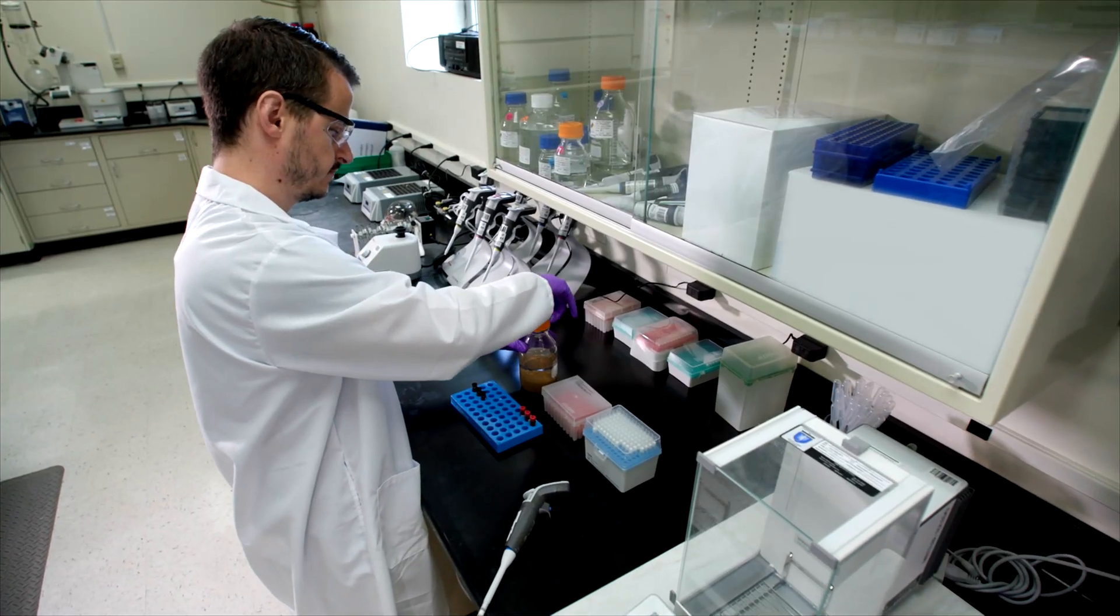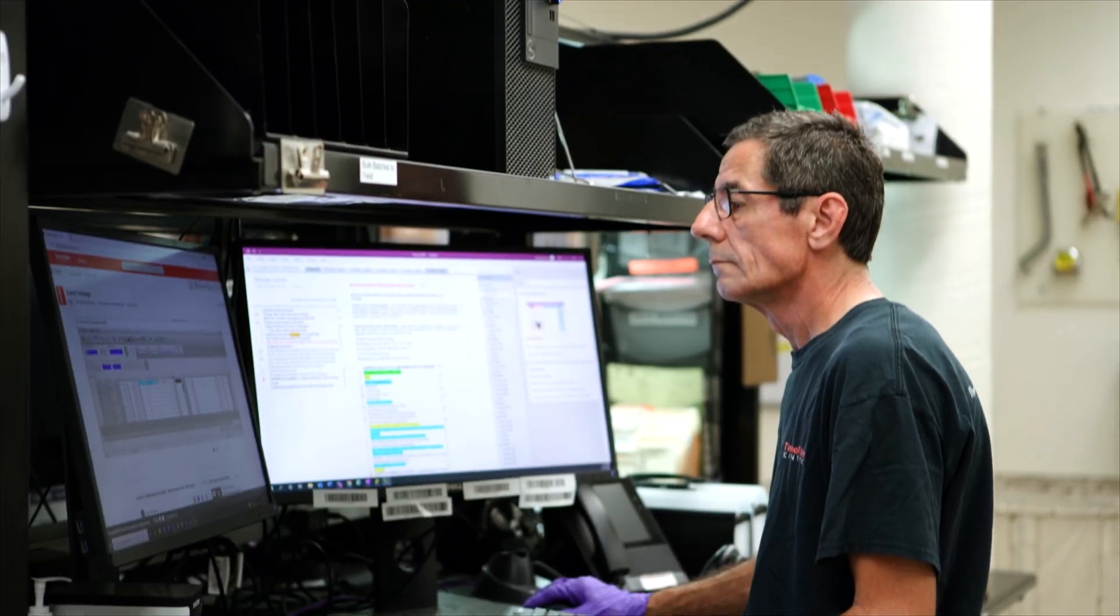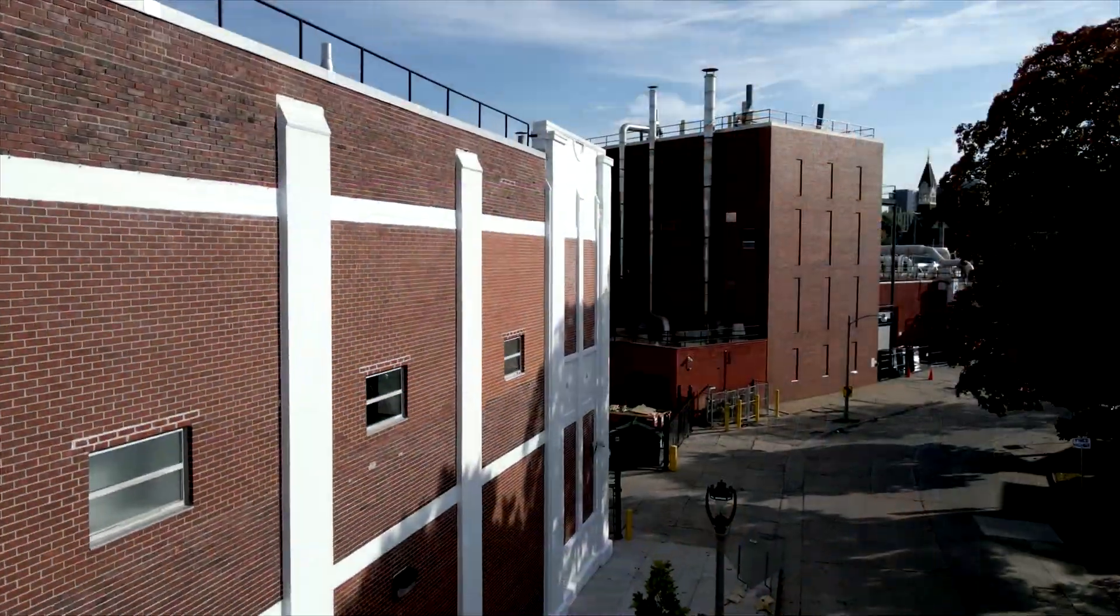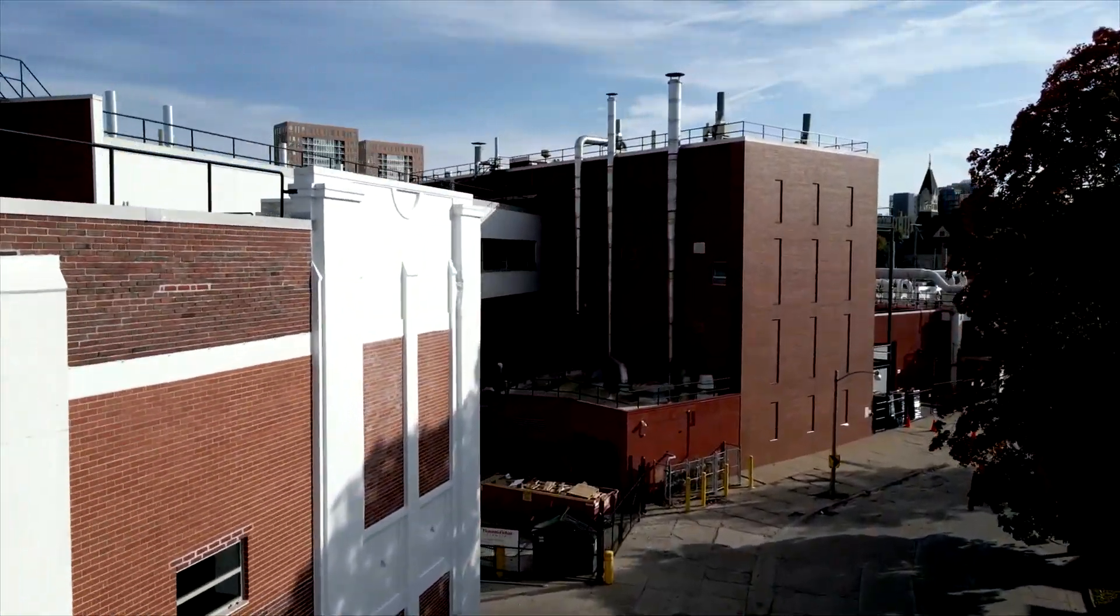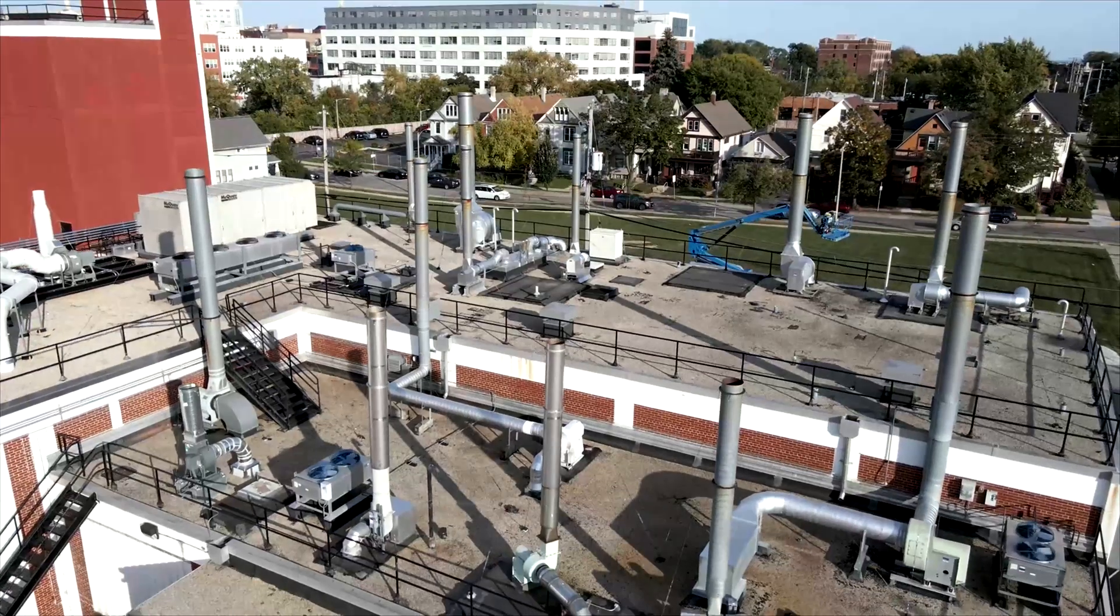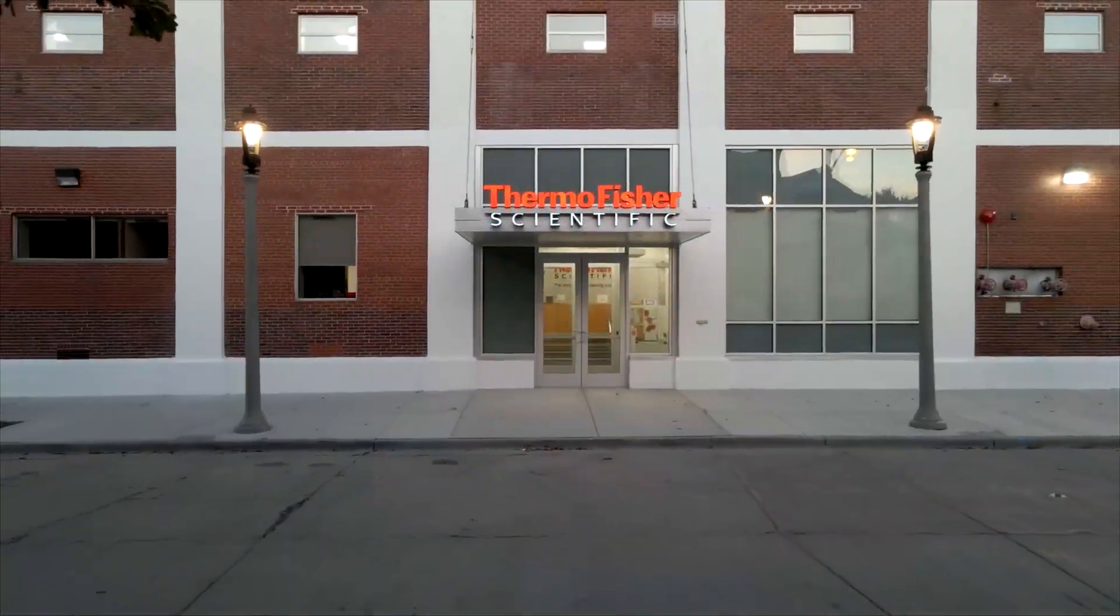With our expanded capacity, refined quality system, extensive customization experience, and dedicated personnel, we at our Milwaukee facility look forward to continuing to support you in nucleic acid chemistry for many decades to come.